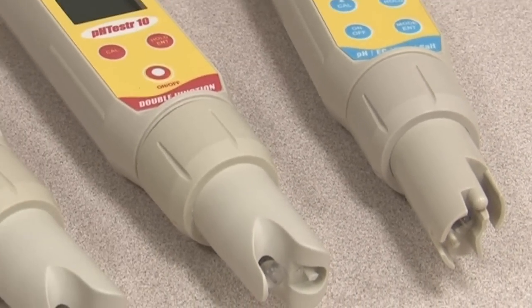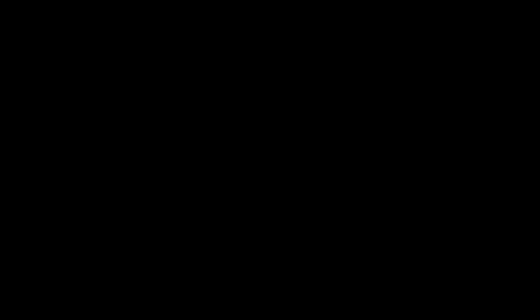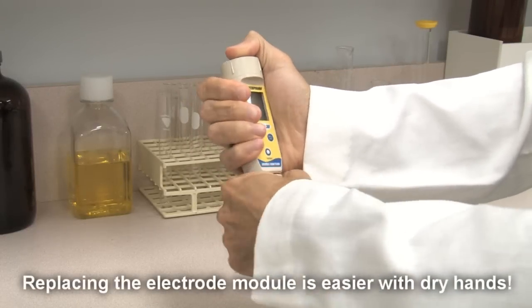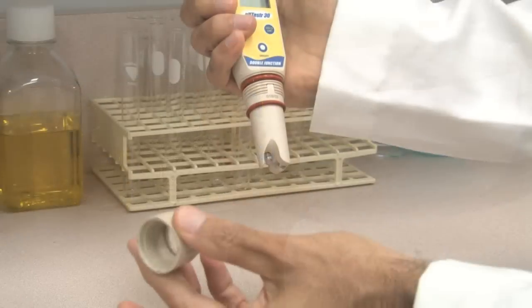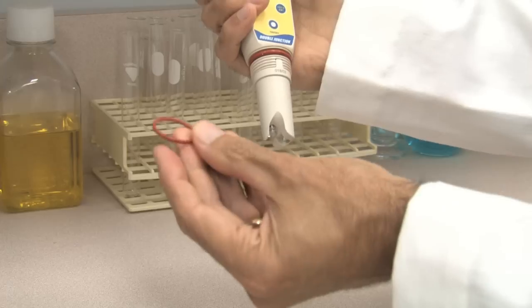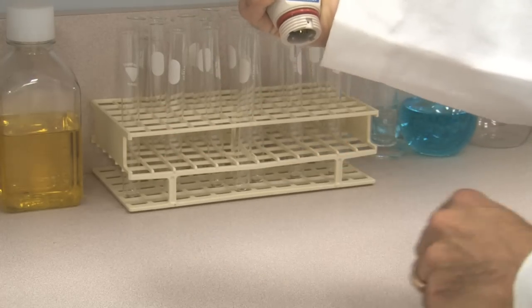It's easier and much more economical to replace the electrode than buy a new pH tester. To replace the electrode module, grip the rib tester collar with the electrode facing you and twist the collar counterclockwise to remove it. Put the rib tester collar and smaller orange O-ring aside for now. Pull the electrode module out away from the tester.